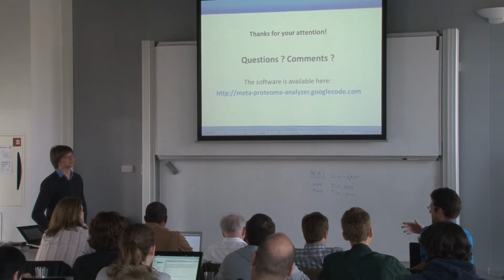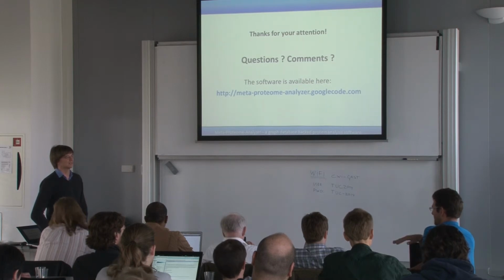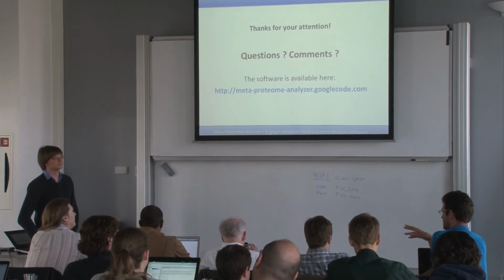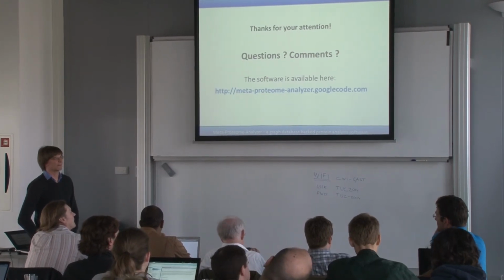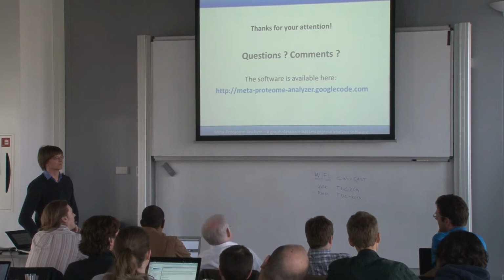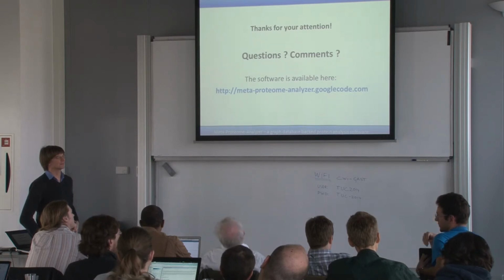Yeah. So basically, just to make sure that I'm getting it, you start with a mass spec experiment, for example, get some peptides out, try to make peptides. How do you deal with the fact that you have about 2 billion peptide combinations that you need to deal with at that scale just to be able to figure out which peptide you have in mass spec? Because that's a humongous explosion of entropy.